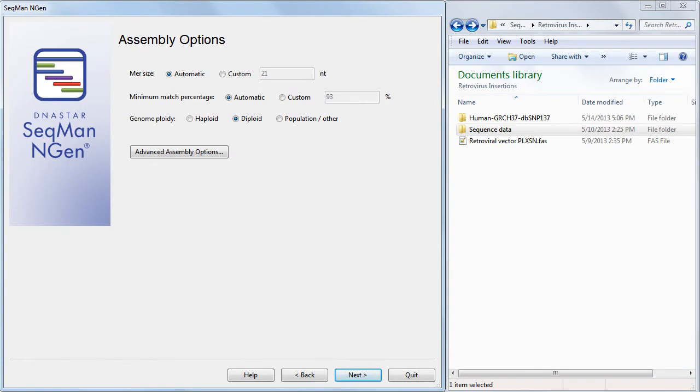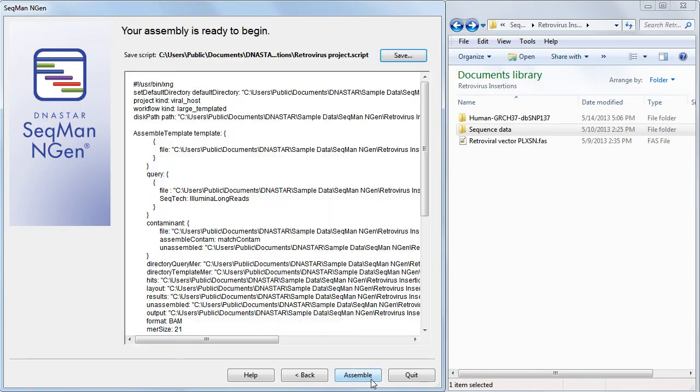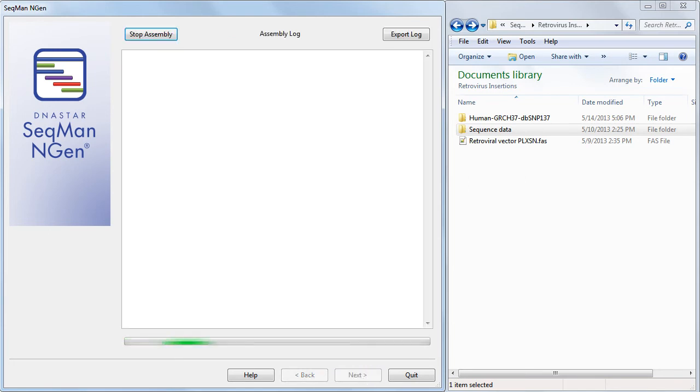We can leave the assembly options at the default values and go to the final screen. Now we're ready to begin the assembly by pressing the Assemble button.